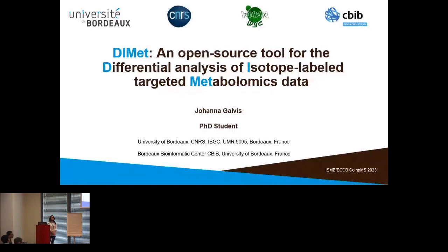Thank you for the presentation. You focused quite a bit on the technical details, how you implemented this tool, but I have to say I'm still struggling to understand how it actually works. Do you require a metabolic map for your organism? Can you use different labeled precursors than just glucose? Do you rely on some feature detection tools, or do you just focus on the raw spectra? How does it actually work?